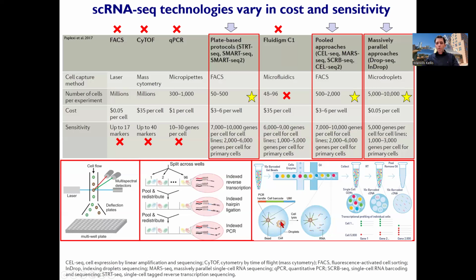Awesome. So the coolest part about this is that after I've done this step of tagging, in my bubble, every RNA that came from that cell with the same barcode, I can then blend all of the bubbles together and do one sequencing reaction. So basically, this entire process is just to tag all of the RNAs that came from the same cell or nucleus. And then what I'm actually sequencing is just a bulk sample. It's the same thing as I did before. Only I did this magic to tag my RNAs based on where they came from. 5, 4, 3, 2, 1, who's with me on this one? Yes? Beautiful. Okay. So that's that.